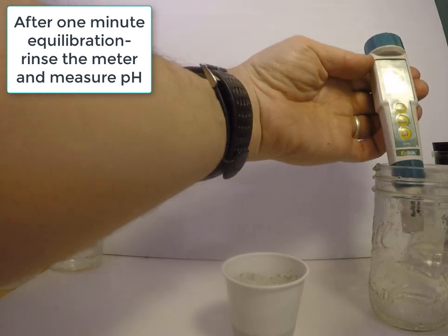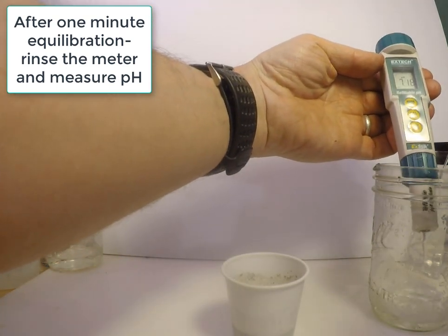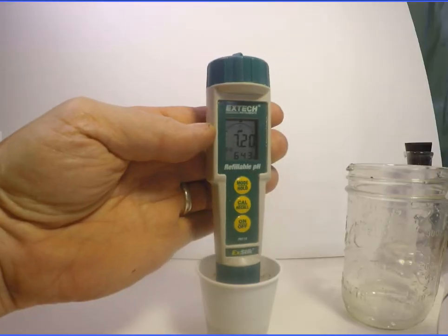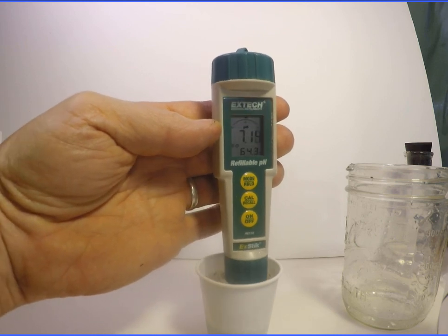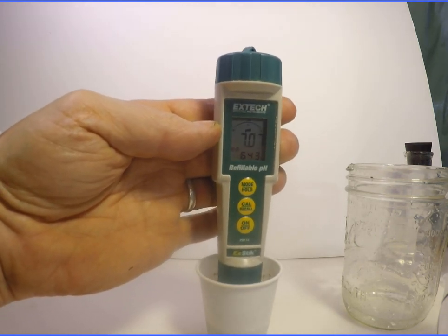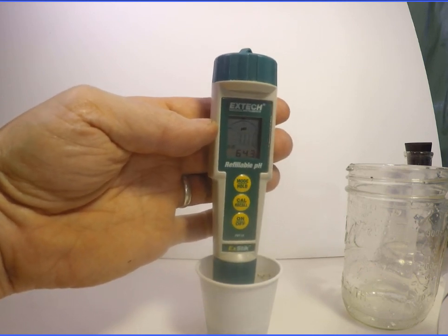After at least 1 minute equilibration, measure the soil pH with the calibrated probe. There will be drifting of the pH at first, but the goal is to measure the pH to the nearest 0.1 unit, or 1 tenth of pH unit, without more than 1 tenth of unit variation in 30 seconds.